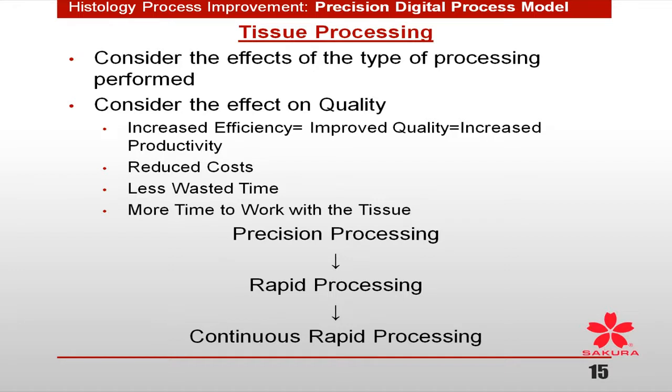Adding value is adding a fixative to it, putting it on the processor, transferring the tissue from the cassette to the embedding mold, creating slides, staining those slides, and the pathologist reading the most appropriate sample selection that will allow them to create the best diagnostic report.